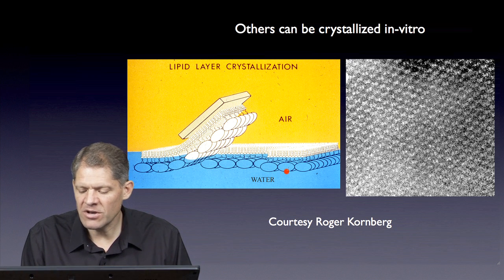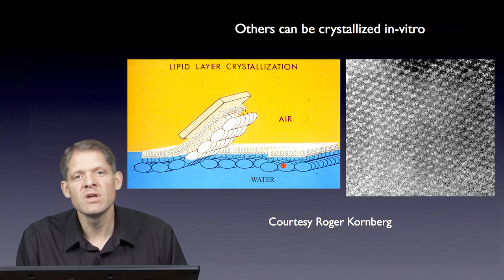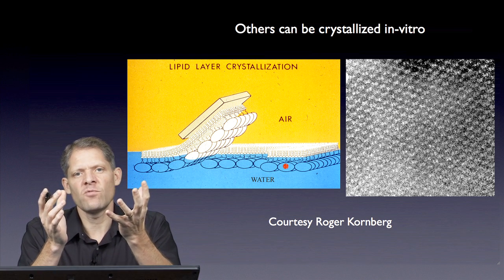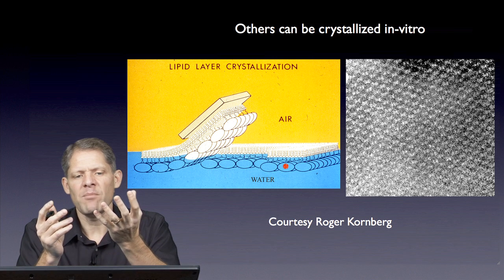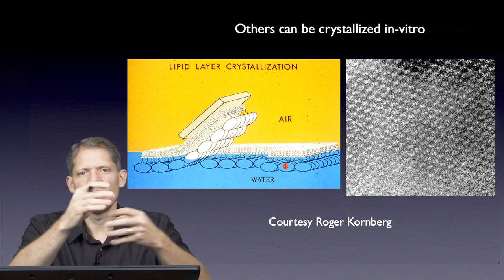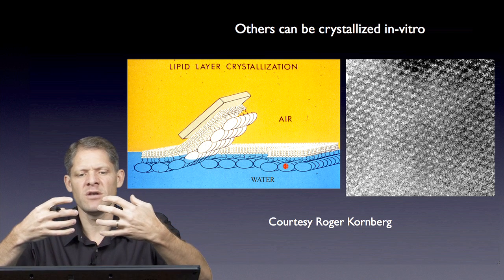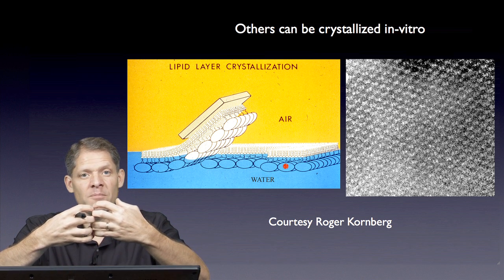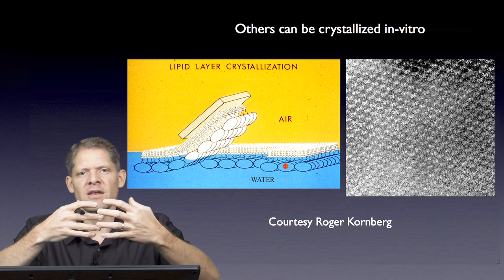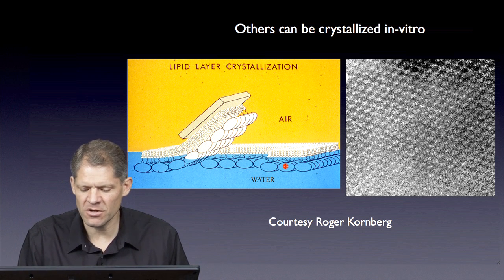Then if your protein of interest has some affinity for the hydrophilic head groups, the protein will concentrate right on the air-water interface. Because the lipid monolayer is still fluid, the proteins can rearrange. So if there's by chance a nice contact that causes one to bind in a regular pattern up to its neighbor, this can propagate into forming a 2D crystal.